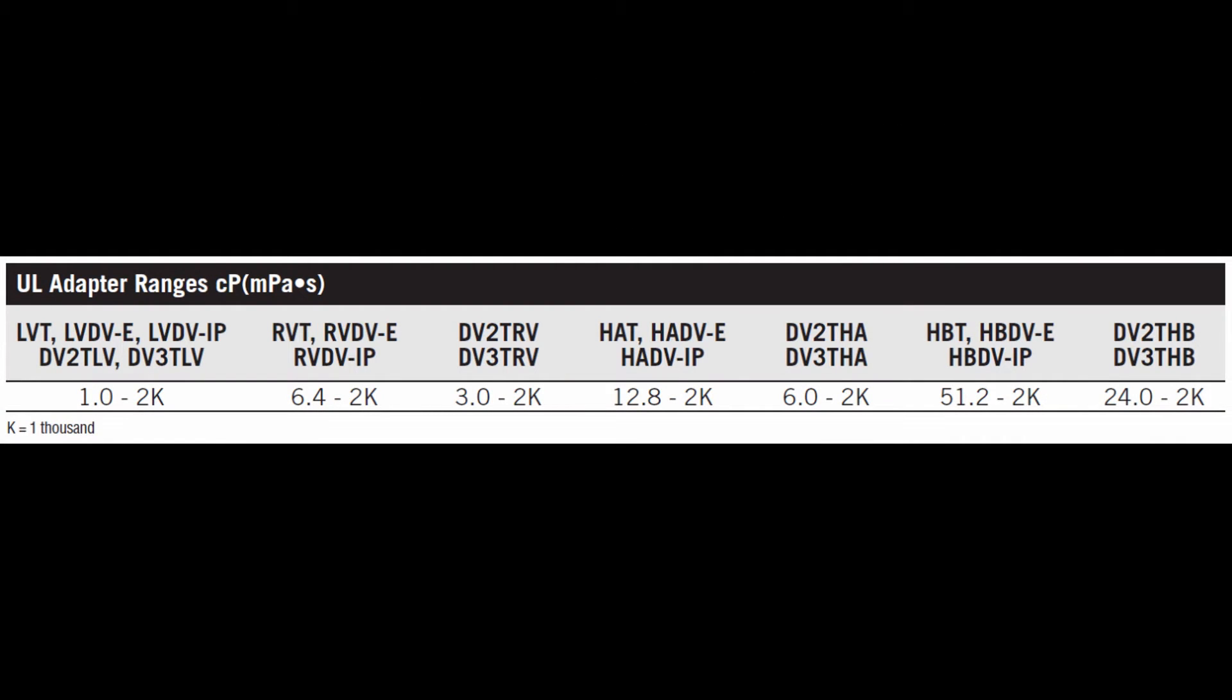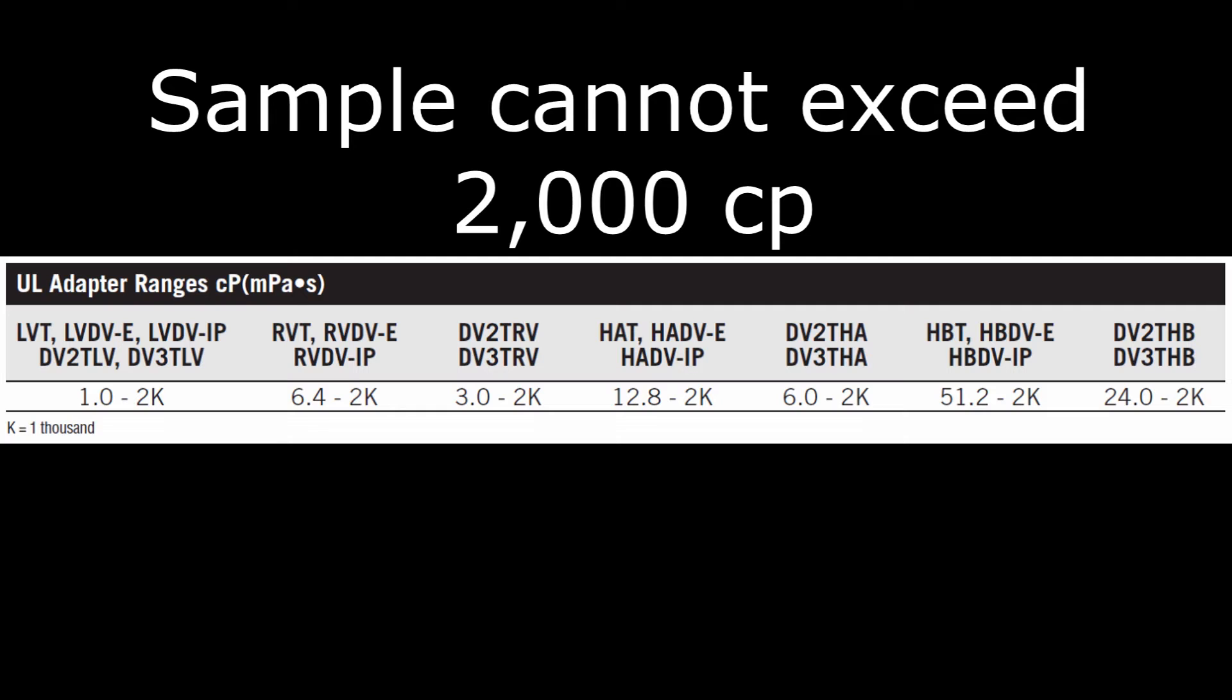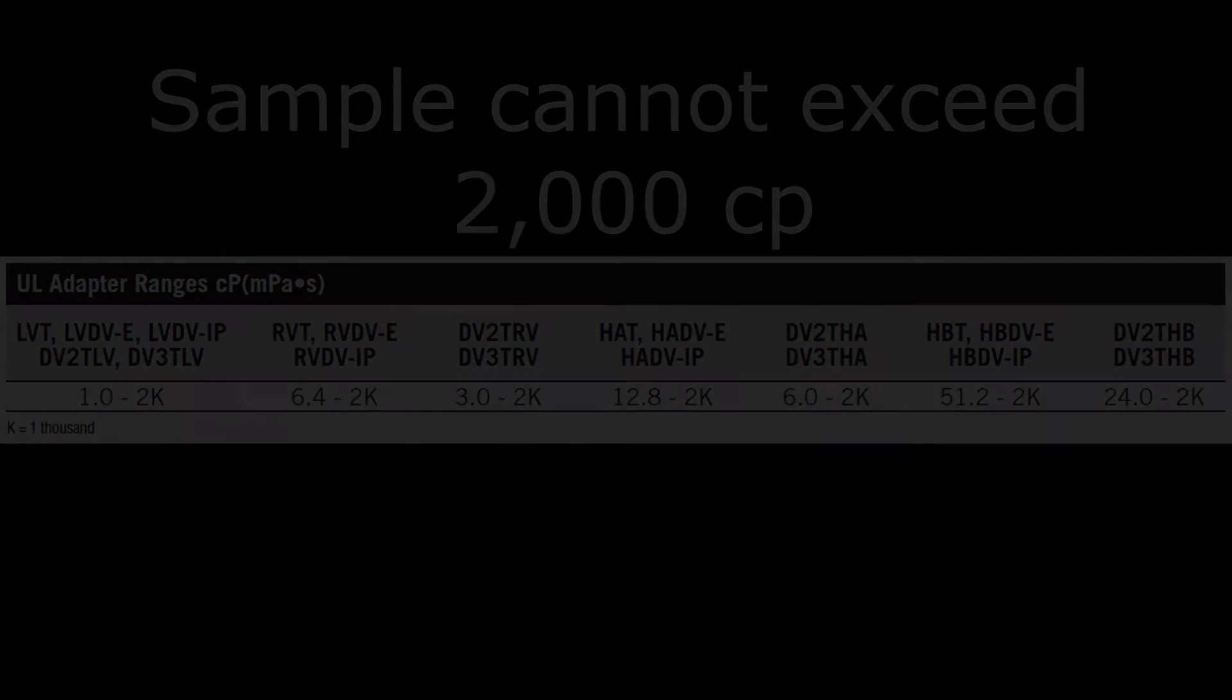Please note the UL adapter is not intended for any materials over 2,000 centipoise. If the material is over 2,000 centipoise, it will be too thick to immerse the spindle into the chamber and can cause internal damage to the viscometer.